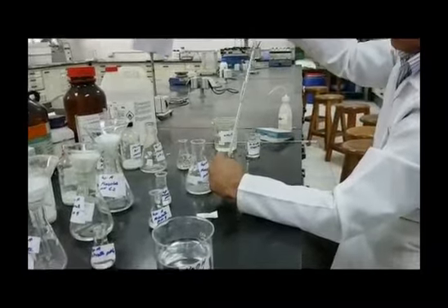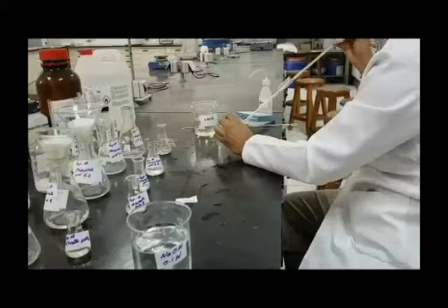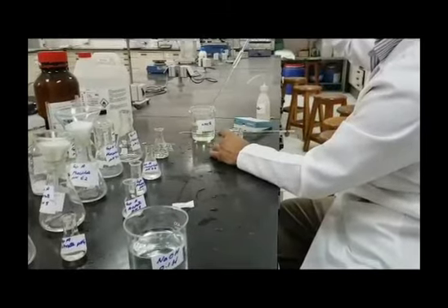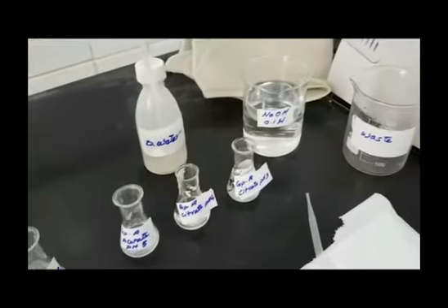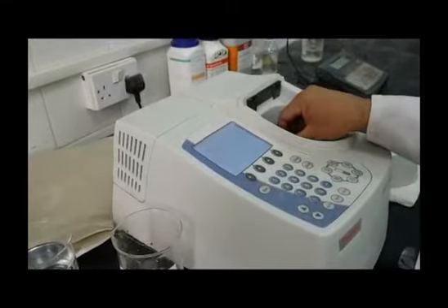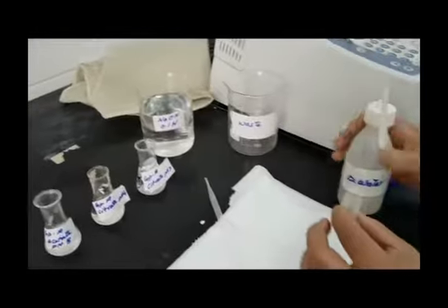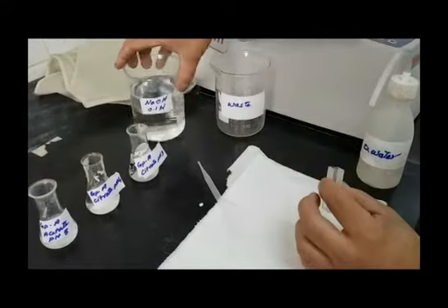After completing the dilution step for all samples, measure the UV absorbance at 287 nanometer, which is the lambda of measurement corresponding to our substance of interest, which is mefenamic acid. As you already know, UV spectrophotometric analysis has some requirements. These include the lambda of measurement, which is most of the time the lambda max of the substance of interest, as we mentioned, and the blank.